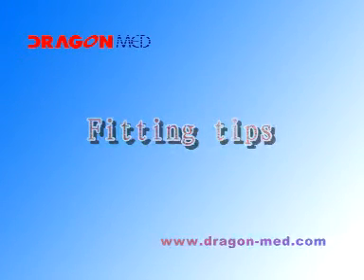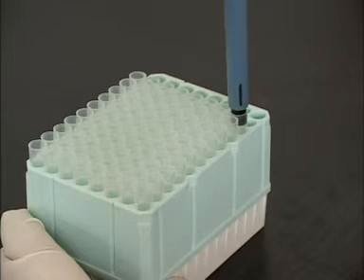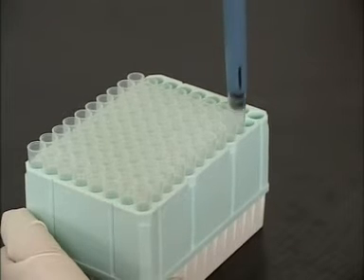Fitting Tips. Single-Channel Pipette: Push the tip cone into the tip using a slight twisting motion to ensure a firm and airtight seal.